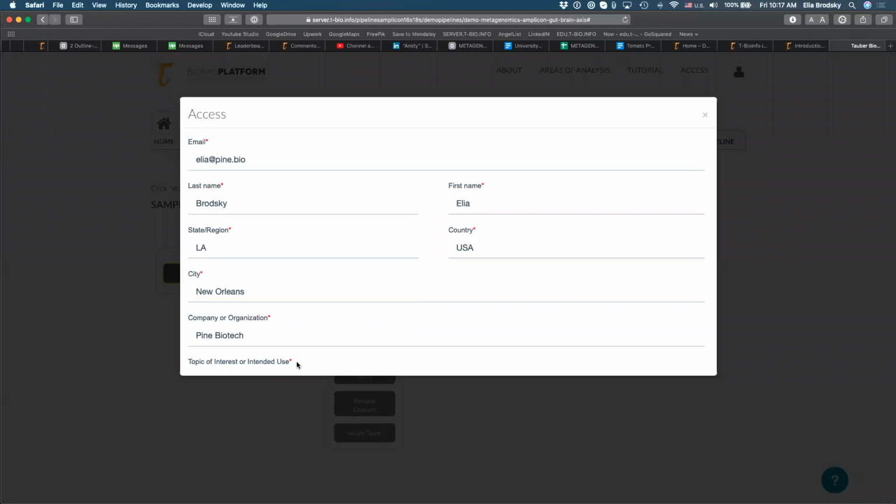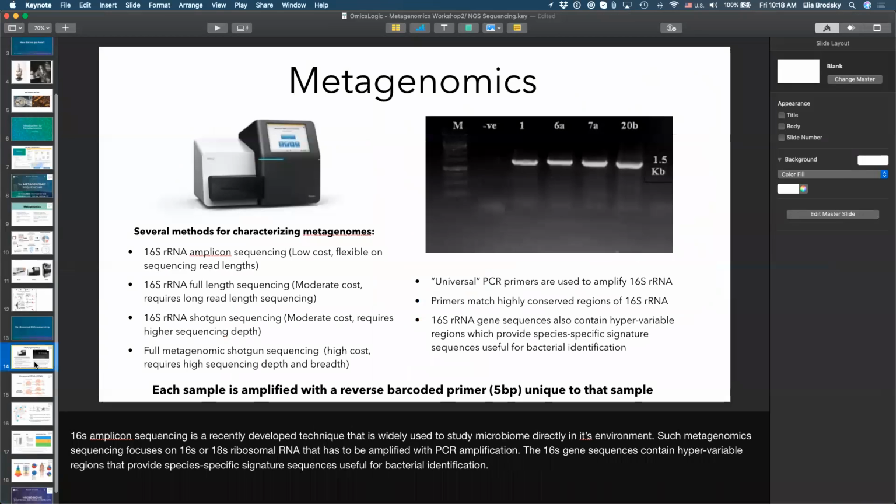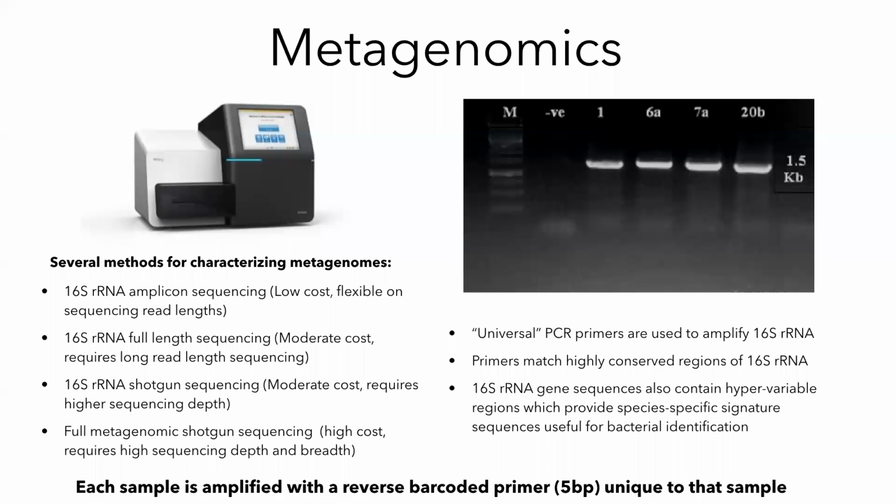So again, shotgun sequencing is unique in the sense that we're trying to sequence a large and diverse pool of microbes. Each one of them has a different size, and a lot of times they're mixed with host DNA, right? So when we talk about 16S sequencing, we are really talking about being able to separate 16S ribosomal RNA, which is only going to be for prokaryotes.